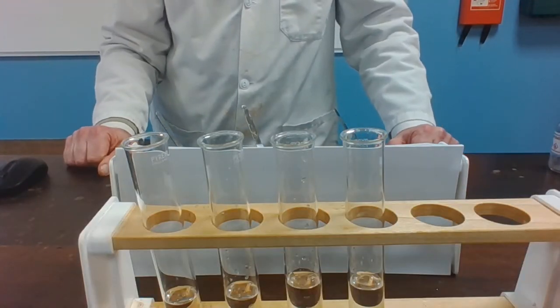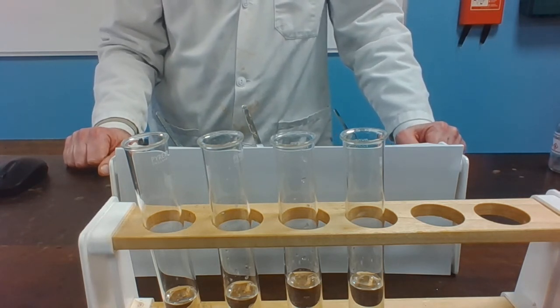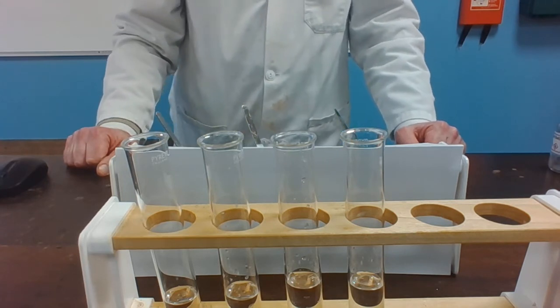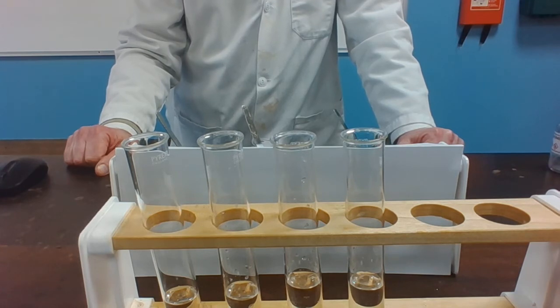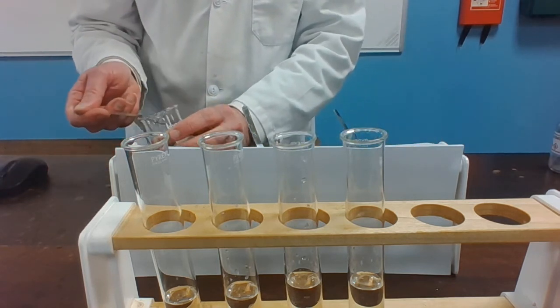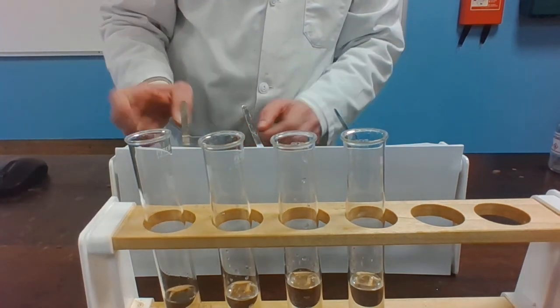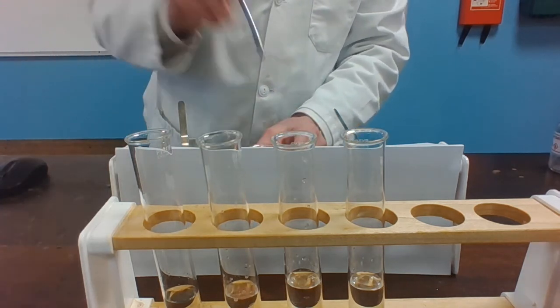The final experiment is a displacement reaction again, this time using lead nitrate solution, which is colorless. And again we're going to add iron, copper, zinc, and magnesium, and we're looking to see if there's any evidence that lead is being displaced. Lead is a silvery-gray metal. So iron filings and lead nitrate. Copper turnings and lead nitrate.